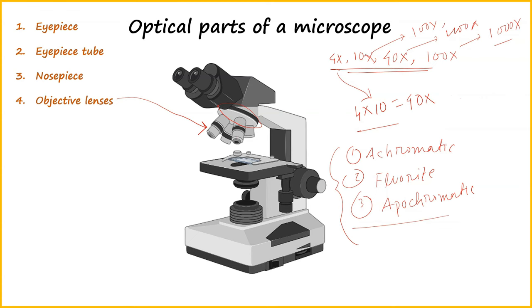Now, what are the applications or what are the functions of the objective lenses? There are different functions, like helping to increase the magnification level of the specimen image, and together the light rays coming from any point of the object unite at a point of the image.